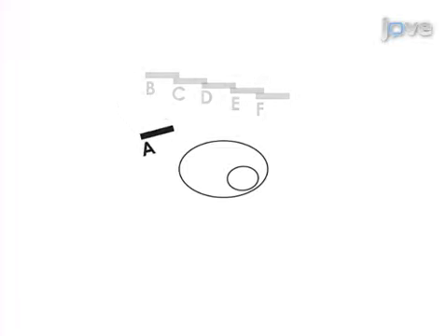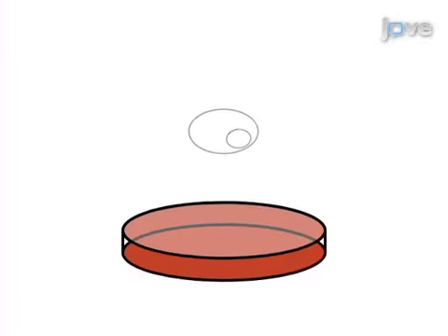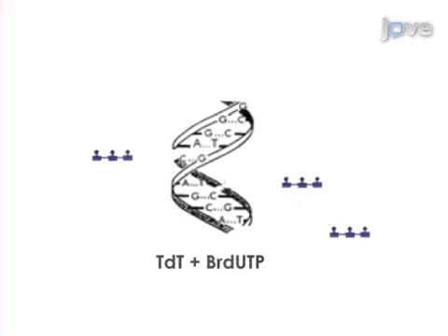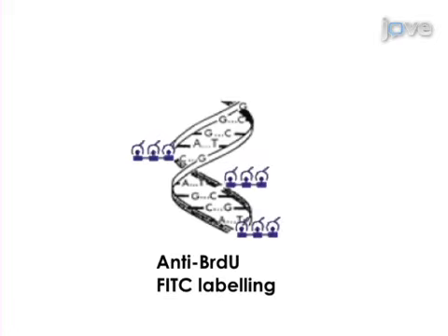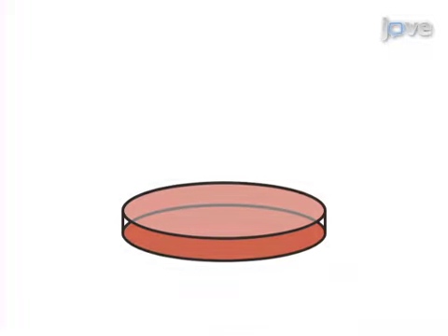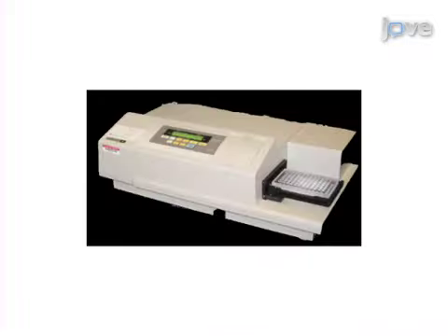To identify apoptotic motifs in HIV-1 Nef, Jurkat cells are exposed to Nef scanning peptides, and a TUNEL apoptotic assay is performed to identify peptides that induce apoptosis. A second set of peptides containing variations on a Nef secretion motif, the secretion modification region, or SMR, are transfected into cells along with Nef-GFP. Loss of function due to competitive inhibition, indicated by decreased secretion of Nef-GFP, is assessed by fluorimetry.